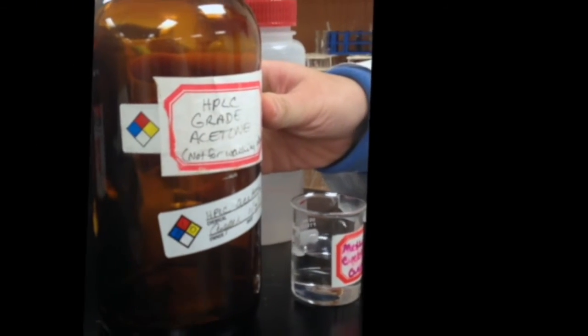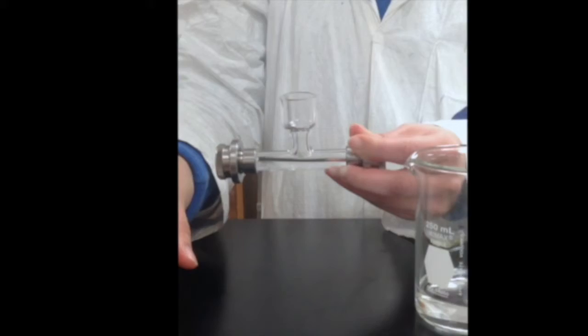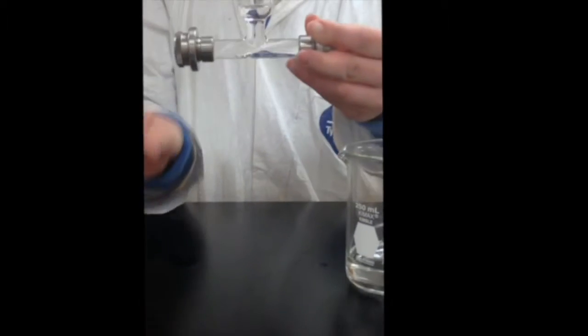Rinse the cell with the HPLC acetone, which is the solvent of the sample. Now you will fill the cell with the acetone and rock it back and forth to make sure there are no bubbles in the cell.